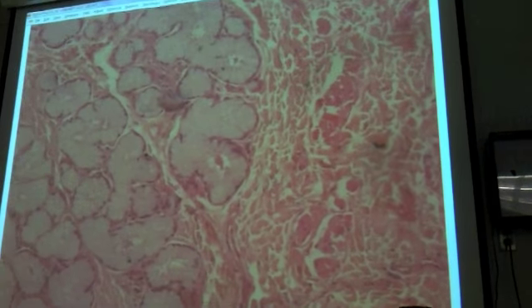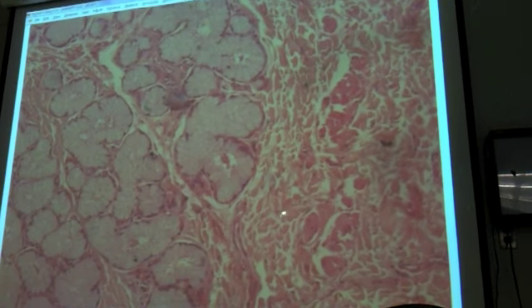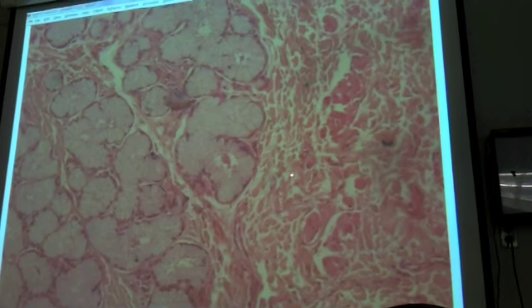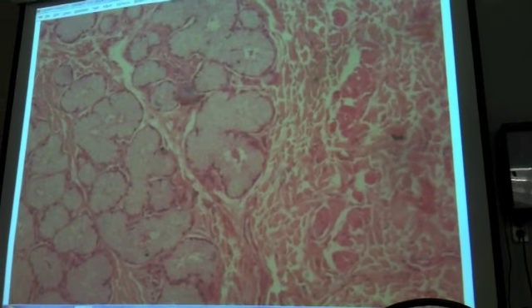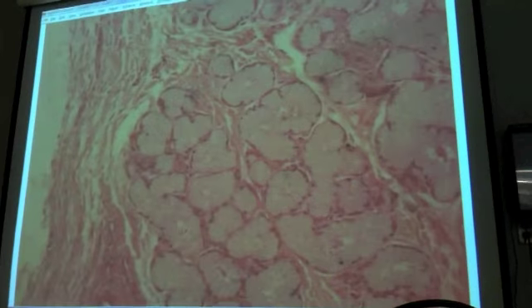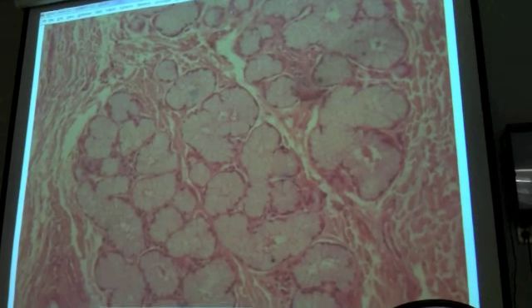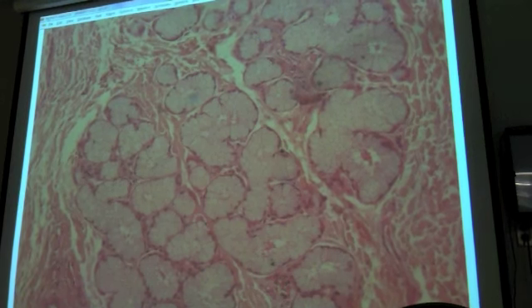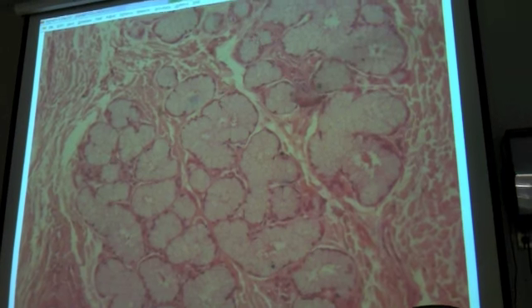But we are getting into the submucosa here, and that's a main layer name, the tunica submucosa, and we have these structures in the submucosa, okay? These are called esophageal glands. And you can tell they're pretty much goblet cells. These glands are producing mucus to lubricate the swallowed food.